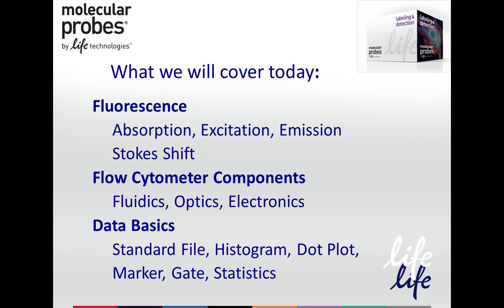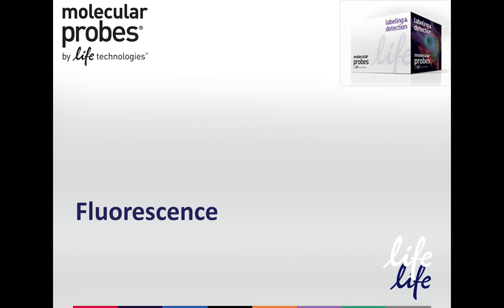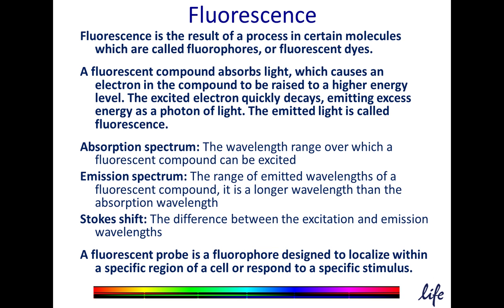Today we'll cover the basics of fluorescence, go over components of a flow cytometer, and discuss some of the basics of data. So let's start with fluorescence.